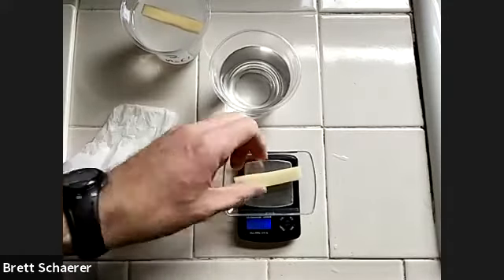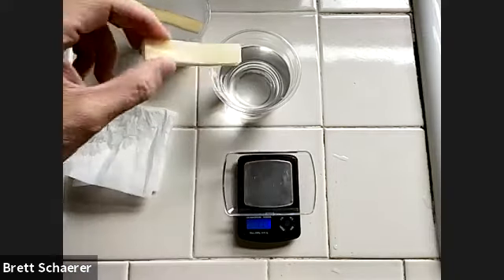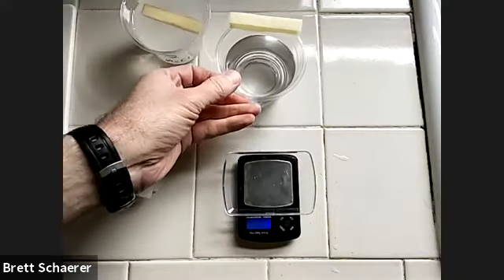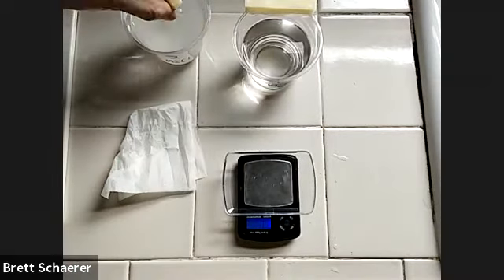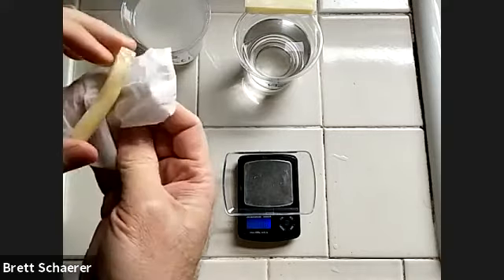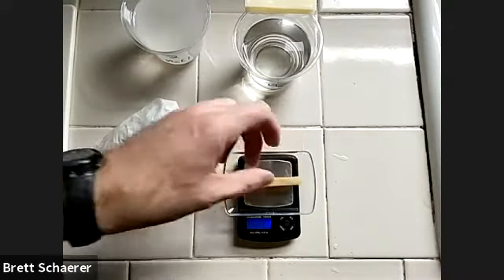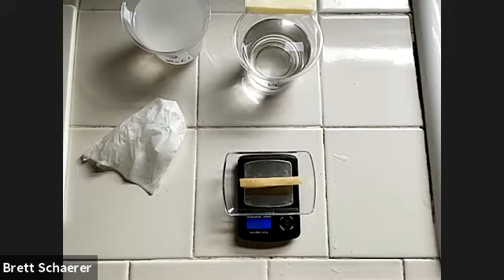Okay. And this now weighs 11.9 grams. And this one started out at 11.0 grams. I'm going to put that right there. And then, again, I will blot the piece that was in the salt water. And weigh that. That is at 9.0 grams. And that started out at 9.5 grams.